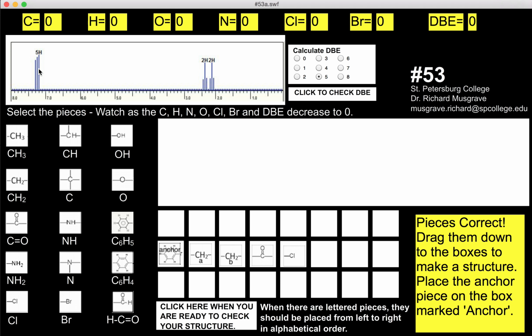And that's exactly what we're looking at here. So there is no splitting of the peaks like we would see if the C double bond O was connected to the aromatic ring. That leaves me with this structure over here.